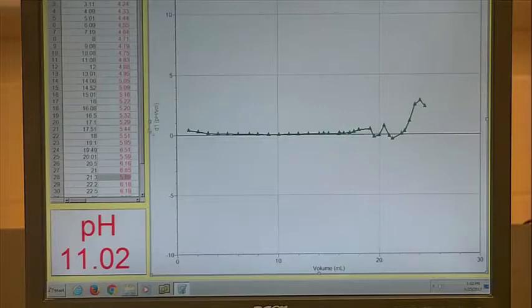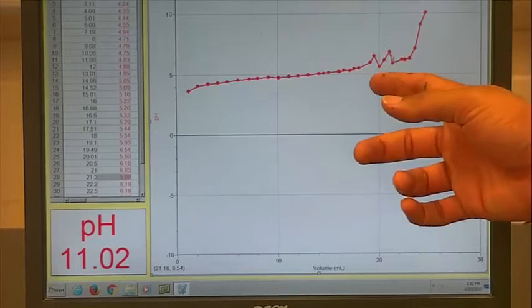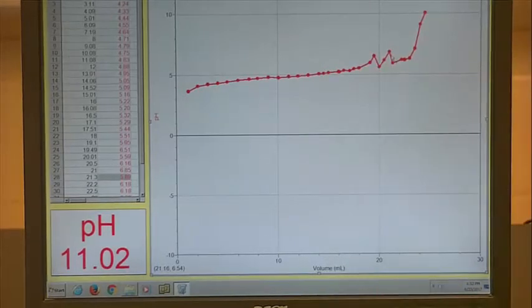One thing is that when you do your pH titration, you're gonna wanna do this twice, okay? So obviously for me, when I did it, I think at this point here and this point here, I put in the wrong volumes, or something went wrong, so that kind of messed up my first and second derivative curve. So you're gonna do this twice, and then average your results. So in total, you'll have three titrations.